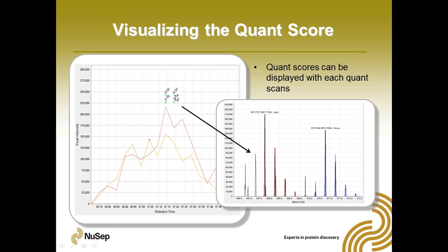So here are two precursor scans that we're using to calculate this ratio. We can see the quant score is 0.5 for these three scans, but I have one scan that's giving me a negative value. The reason these are here is because you can now click on this and have a look at the peak and see if you want to remove it or not. So in this case, we have one of 4 total scans that's getting a bad alignment, or in this case, it's a good alignment, but it has an overlapping precursor. So again, the negative 0.75 is what's going to be reported in your table. You can go into your XIC, see if that's the case, decide if you want to keep it or not. Okay? And here we see evidence of that.